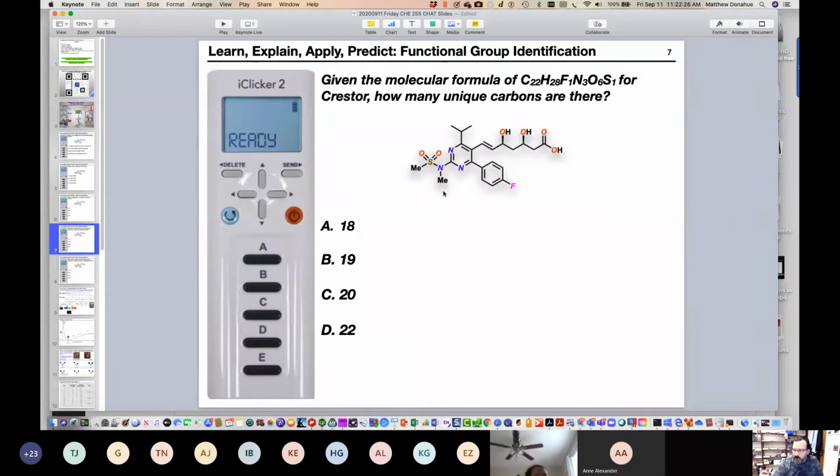Some immediate responses say no, and that is correct, because this methyl group is bonded to a sulfur, and that methyl group is bonded to nitrogen. So yeah, they're different, right? So we have 1, 2. Here's a carbon, that's 3. Let's stay in this ring, 4, 5, 6. Now let's go up here. So we're at 6 so far. Let me write that down so I don't forget. 6.